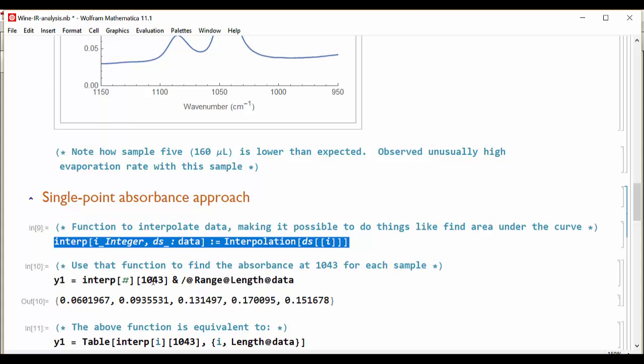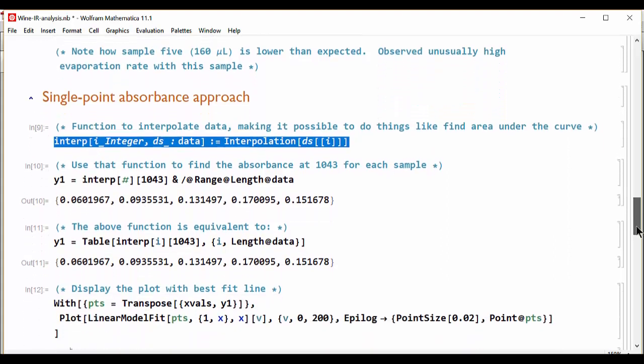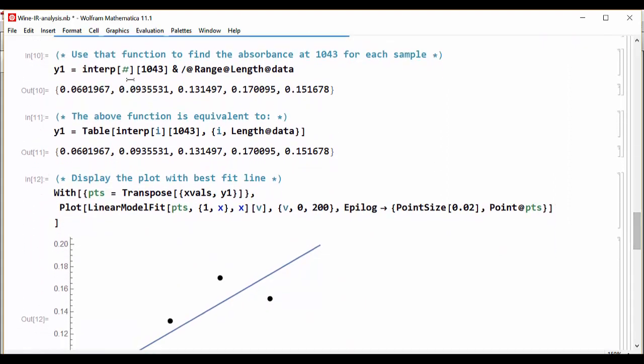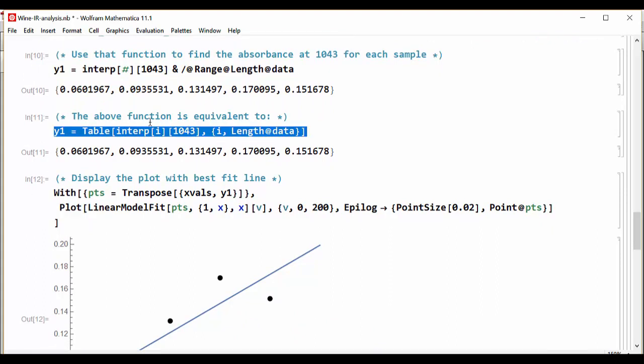For right now, I can just take this interpolation function and use any of the data sets one through five and extract the absorbance at 1043 wave numbers and we get those results. That function using the unnamed function is the same as creating a table where we loop over the length of the data set and you see we get the same exact results.